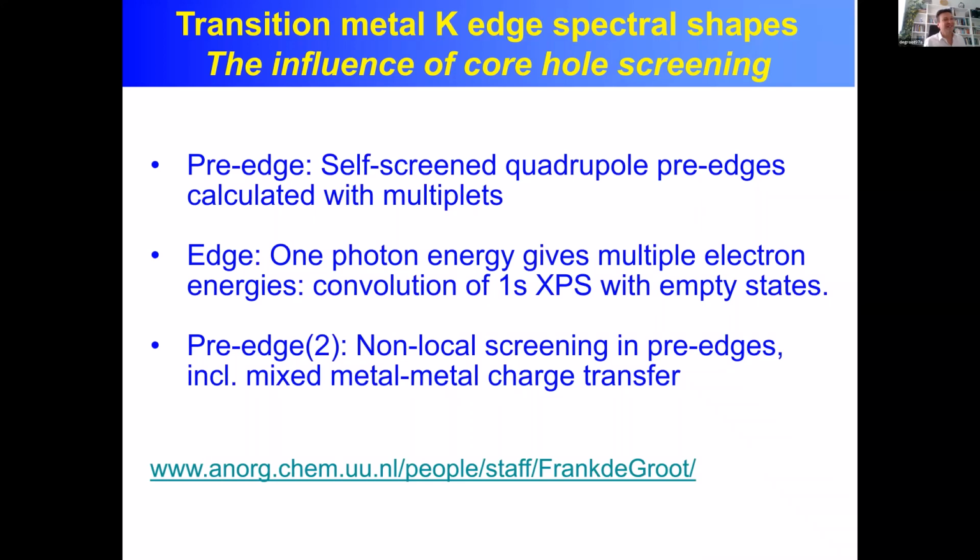So the Eg quadrupole exactly overlaps with the T2g dipole. It has been analyzed in detail by many people, for example by Delphine Cabaret 20 years ago, I think. I would call that non-local screening, or the shift between dipole and quadrupole.